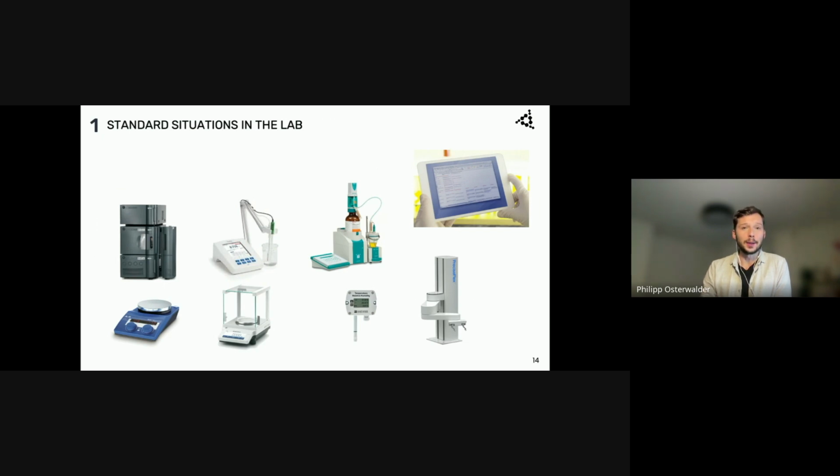If this is a highly used, highly engaging device, which also provides a lot of information, kind of a multi-method device, which delivers hundreds of results or even thousands of results per day, then there can be a good reason, and a calculated reason, why an integration makes sense.